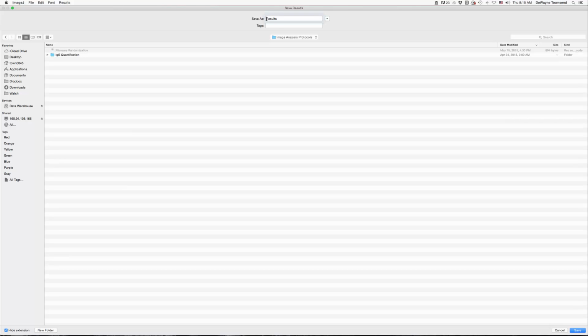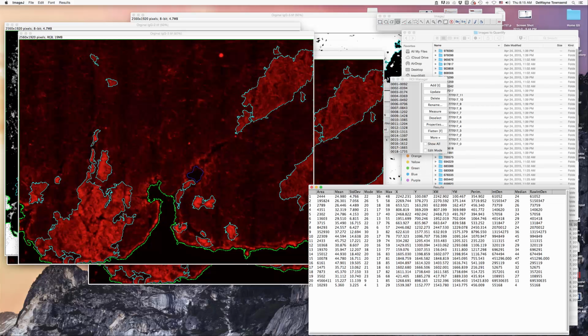So what we really want to do is enter in up here the number of the mouse. So I don't remember. This one didn't have a number. So the number and then the image, something like that, and then the results, okay? And with that, that'll be great. So we can save that. Alright, and then that saves the data, which of course is important.